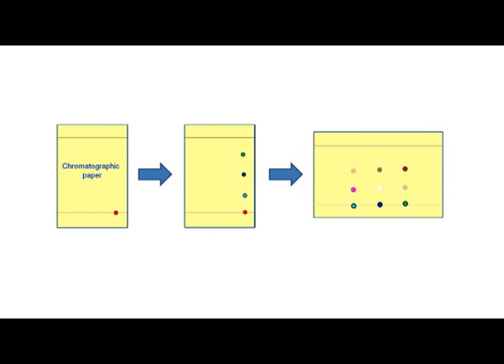In this method, firstly a chromatogram is developed in one direction, and then a separation is carried out on the same paper in another direction. So, it is just like two-dimensional chromatography. This two-dimensional development results in the separation of the components or spots in the first chromatogram into further components, and here the same mobile phase or different solvents can be used for the second dimension separation.